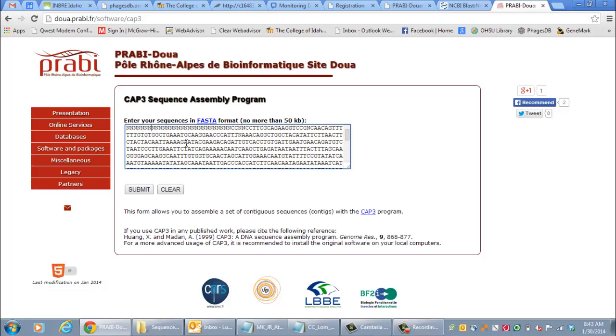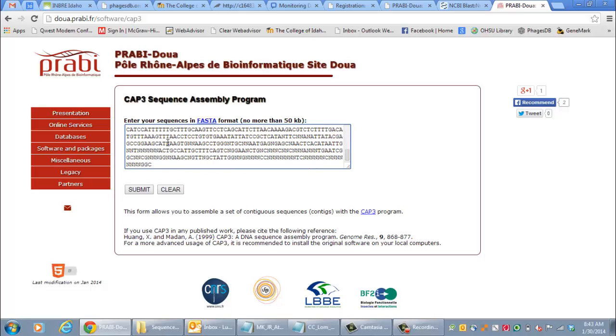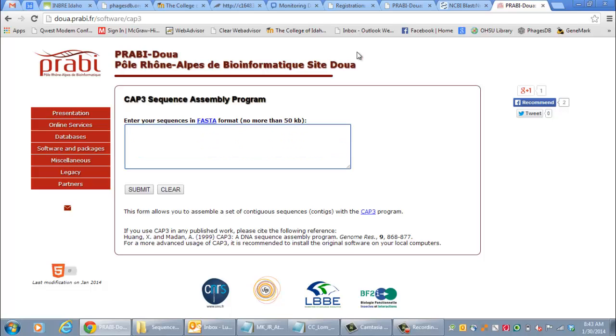So if you scroll up now, you can see the beginning of our FASTA file all the way down to the end. And I'm not going to click through all of them here to show you. This is going to be like a cooking show. I have one all set up to go. So you do that for each one and enter all of them together. And so I'm just going to do that now and paste them all in at once.